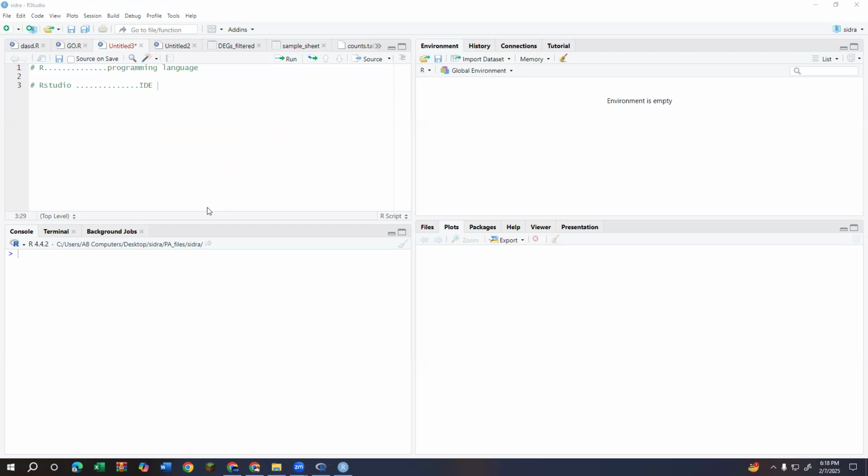Okay. Now next, all participants please make sure you have the latest version of RStudio. I have R 4.4.2 in the console. You can check, I have encircled R 4.4.2. So please all participants check the version of R from here and let me know if you have the same 4.4.2, and type here your version name.